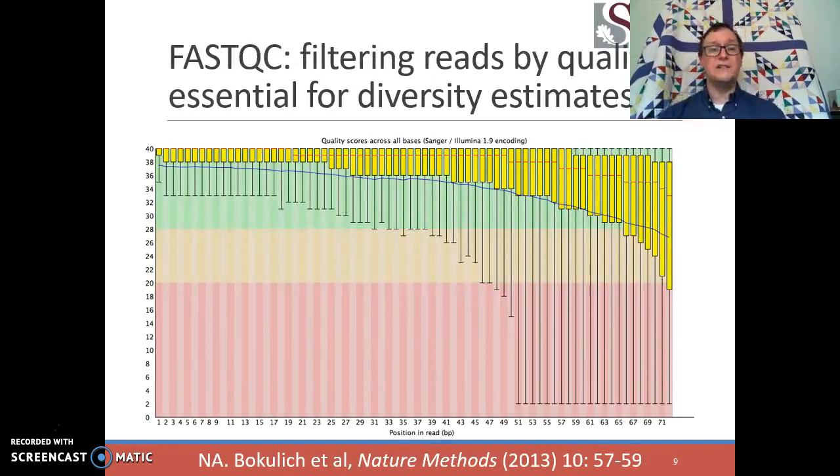Which brings us finally to FASTQC. FASTQC is some software that's intended to look at these Phred scores at a very large scale. So first off, what is a FASTQ? A FASTQ is a file of raw sequence produced by a sequencer. Typically, we find these being generated by next-gen sequencers. So if you have millions and millions of sequences all being output by this sequencer, they're all going to get dumped into a FASTQ file.